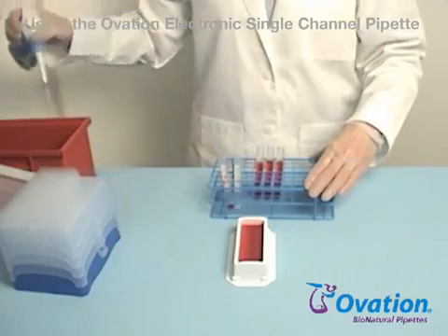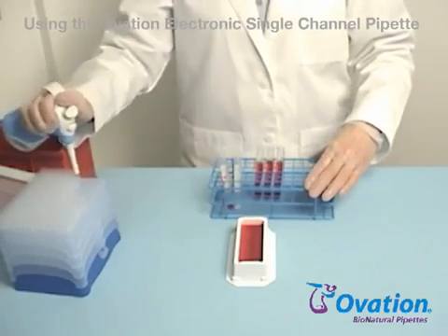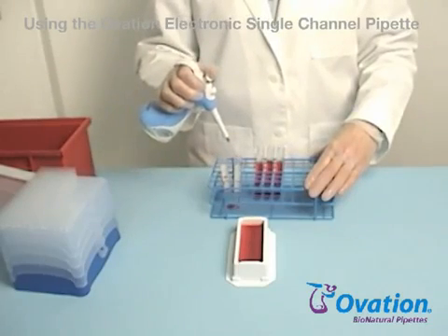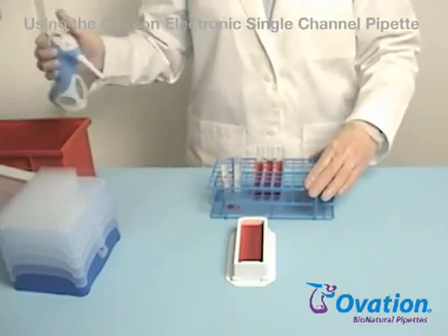Please practice now picking up the pipette, applying tips, and doing a simple aspirate and dispense. Then review the instructions for setting up and using Ovation's other liquid handling functions.